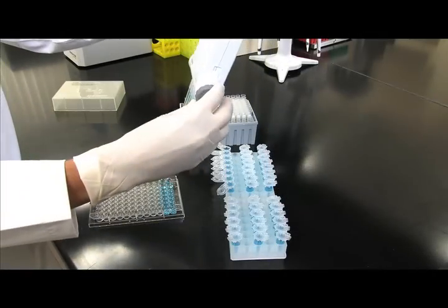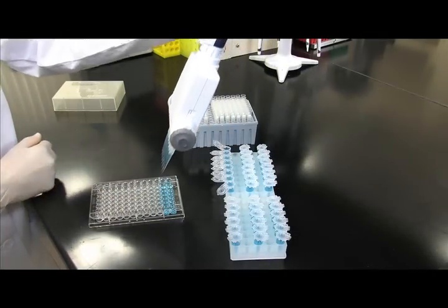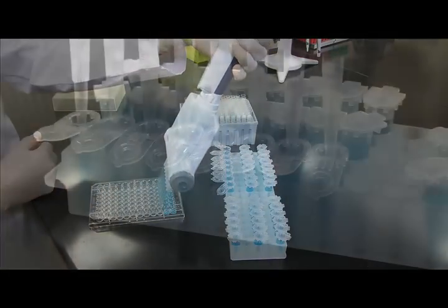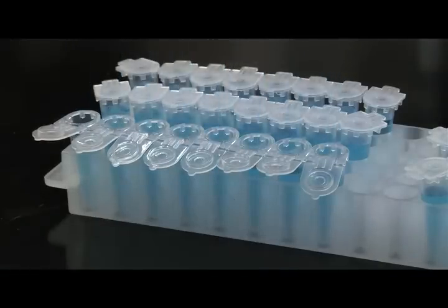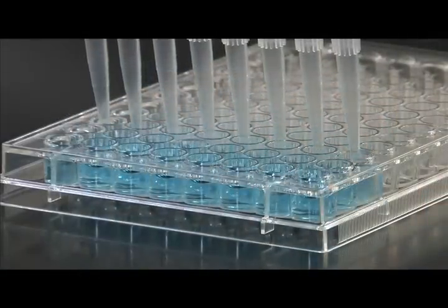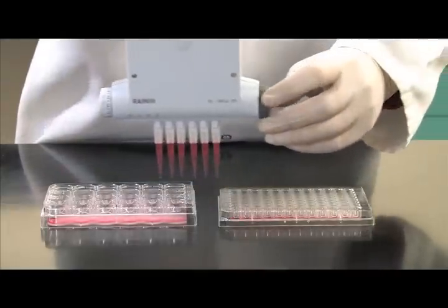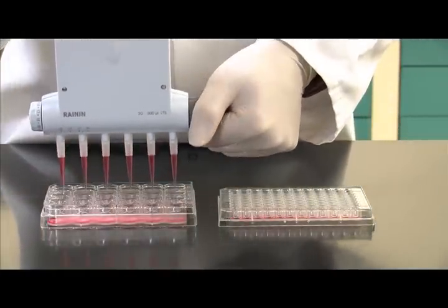Its smooth variable spacing lets you quickly move samples between different formats. For example, from micro-centrifuge tubes to 96 well plates or between 96 well plates and 24 well plates.